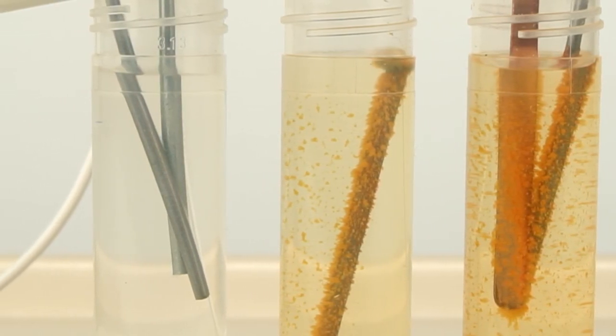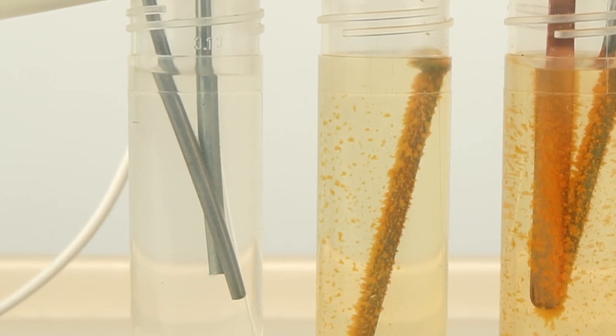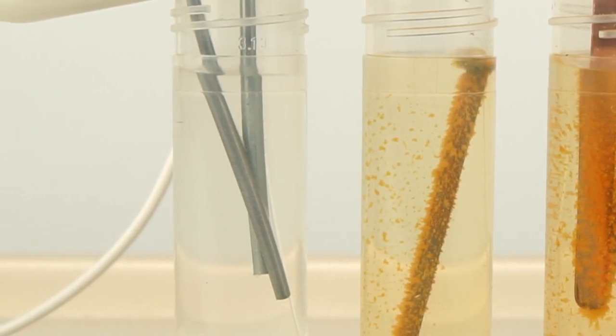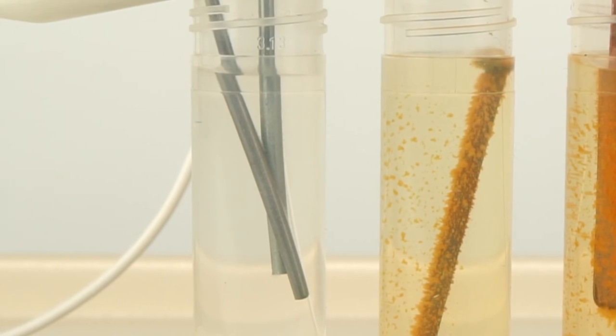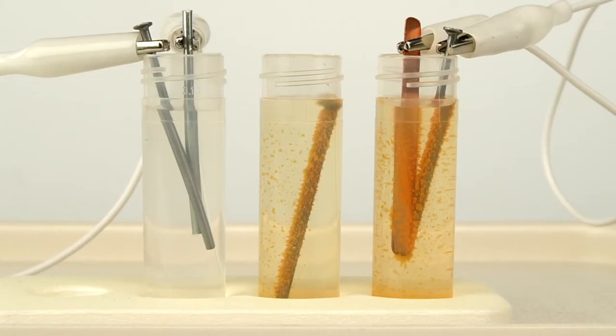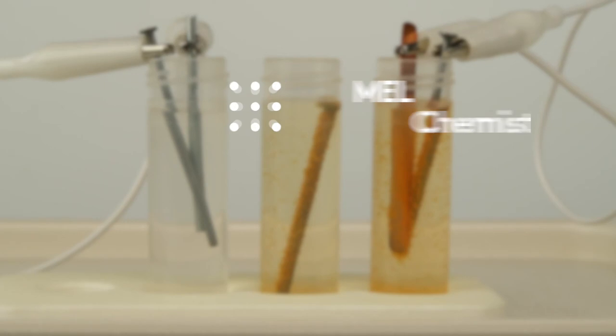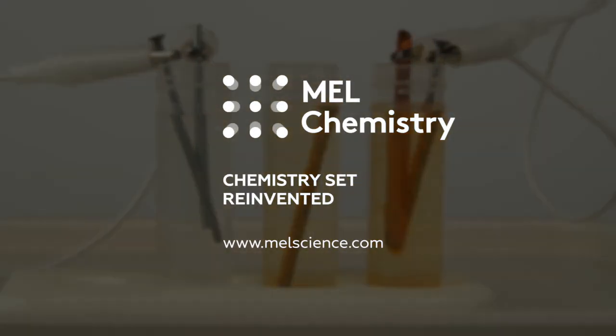In the iron-zinc setup, zinc is the more reactive of the two. When electrons leave the zinc rod, it rusts and in so doing protects the iron nail from corrosion. Learn more about this experiment on our MEL Science website.